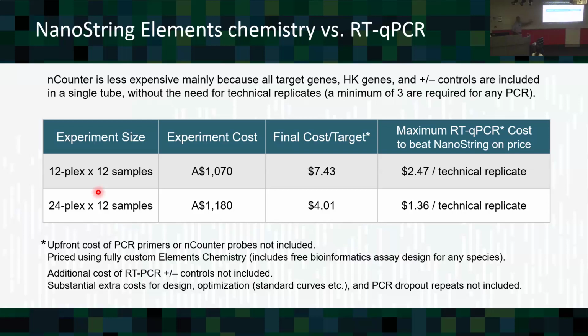And when you understand this, when you get your head around it and you use it, and from your point of view, these machines are available. There's several in Queensland. The biggest and best facility in Queensland is at Griffith University on the Gold Coast. It's not far away. It's only less than 2 hours away if you drove it down. And Nick has 2 of these machines, right? He has everything. He's got more nanoString instruments than anyone in the Southern Hemisphere. Yeah, and we've worked with him. You work with Nick. He's pretty quick, yeah. He's better now. He's grown, I think.